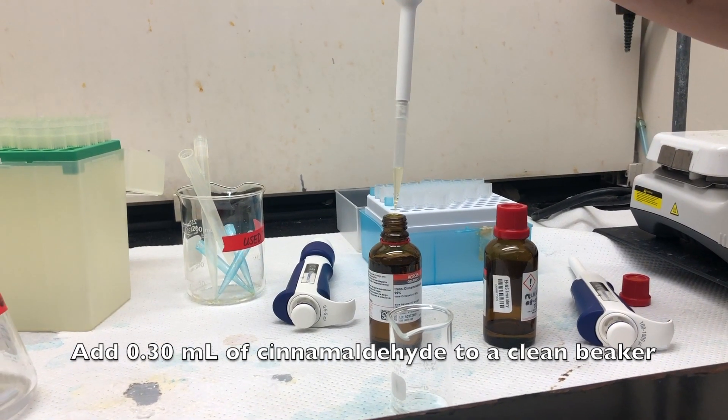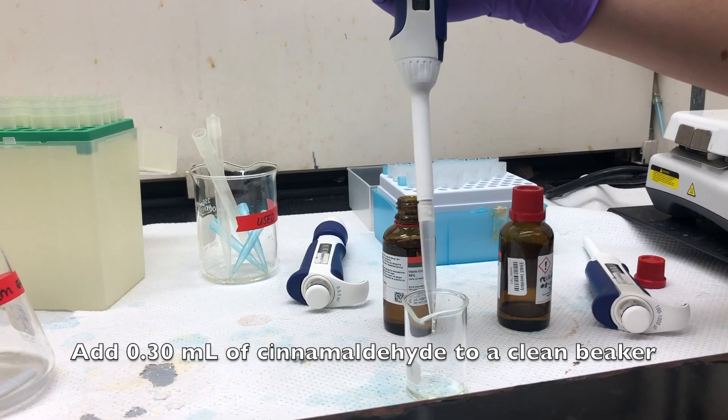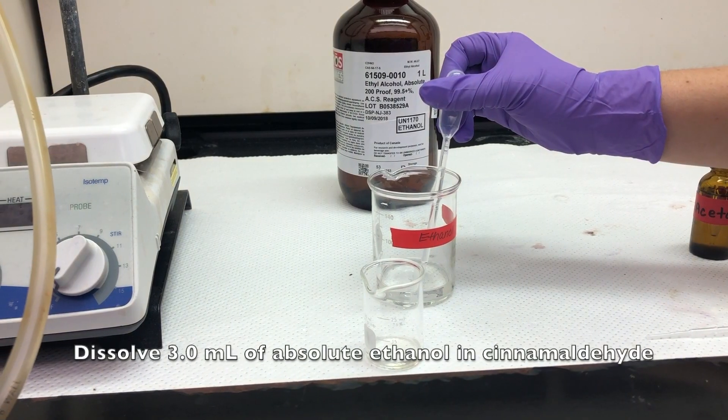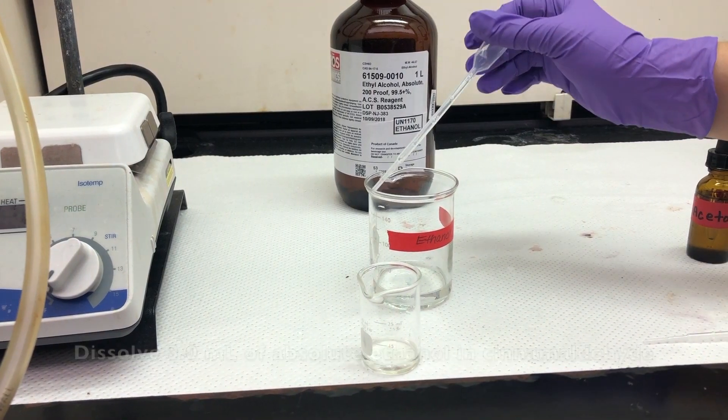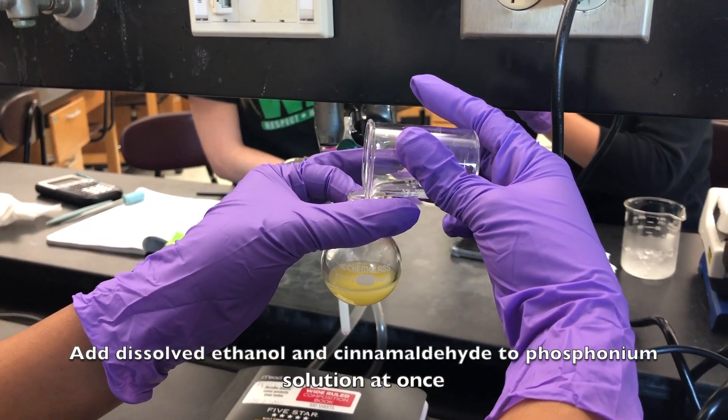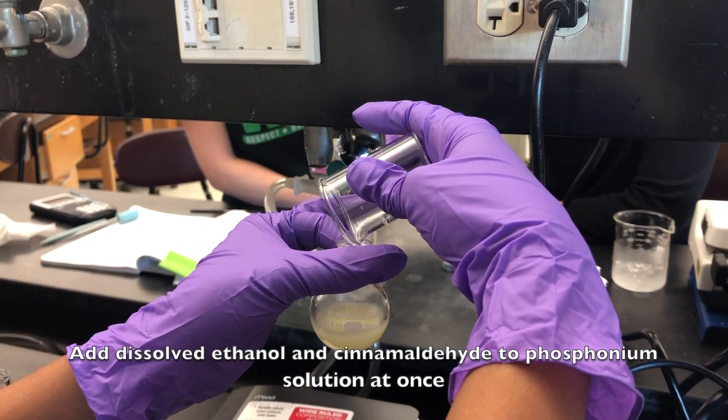Add 0.3 milliliters of cinnamaldehyde to a clean beaker. Dissolve 3 milliliters of absolute ethanol in the cinnamaldehyde. Add dissolved ethanol and cinnamaldehyde to the phosphonium solution at once.